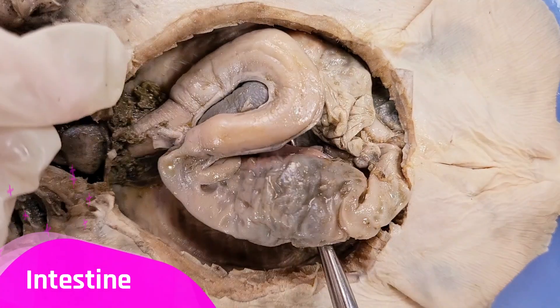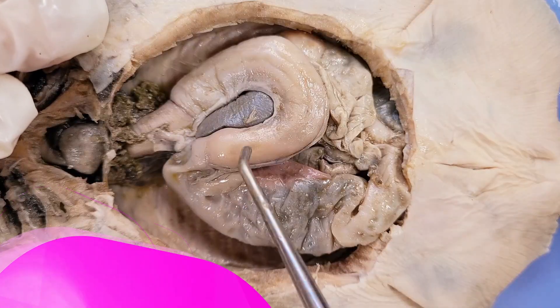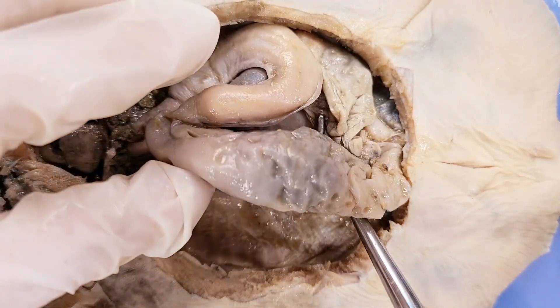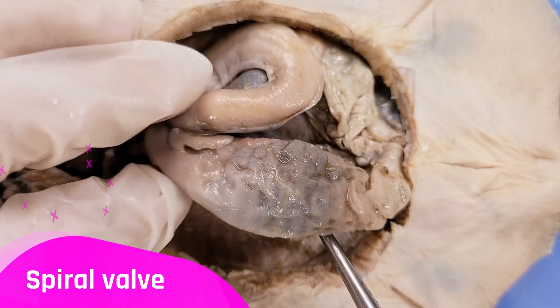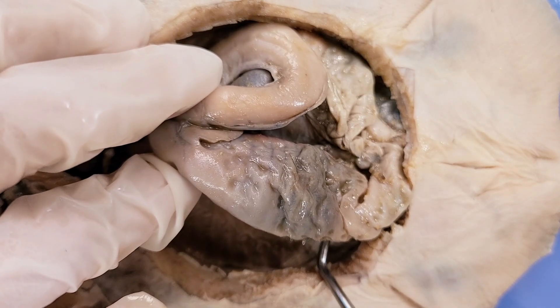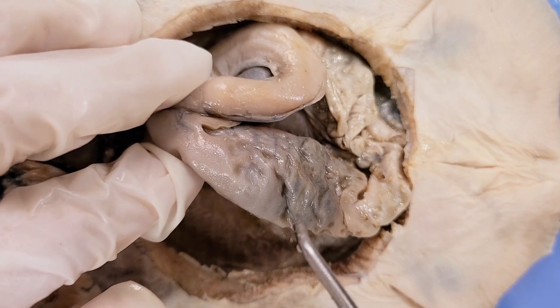Here is the skate's intestine — it's this whole structure here. The pyloric valve here separates the stomach from the intestine, and the intestine is where nutrients from the food get absorbed. There's a spiral inside the intestine called the spiral valve. The function of the spiral valve is to increase the surface area for digestion and absorption of food, while also conserving space in the body cavity for the large liver and for the development of egg capsules.